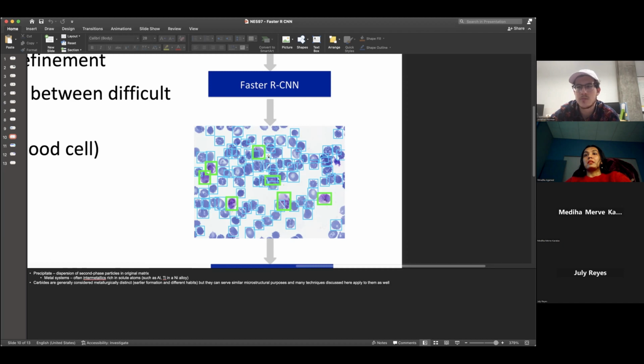Yeah, so it definitely does some level of image analysis, but it's decoupled from the main convolutional neural network that the rest of the process operates on. So it doesn't have that learning step where, following bounding box regression at the end, it makes those corrections to further improve the model. That's my working understanding of it.